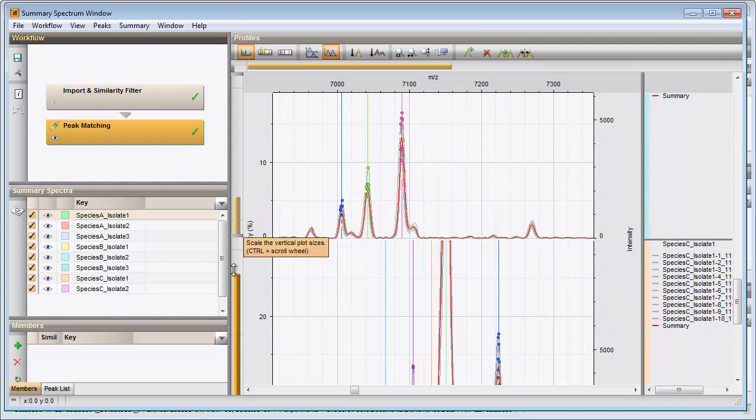With the zoom sliders you can zoom in on the spectra. I will save the summary spectra to the database by pressing the Save button.